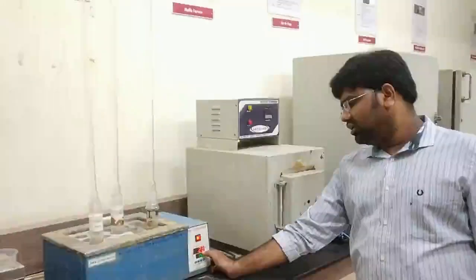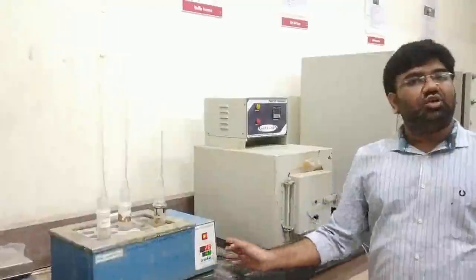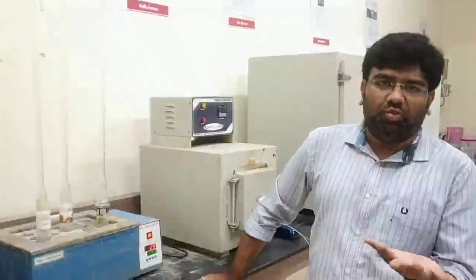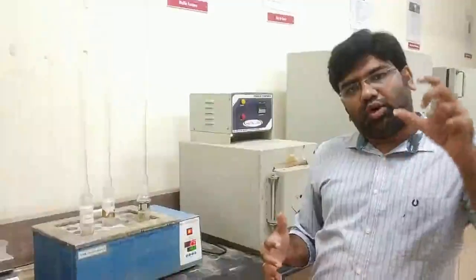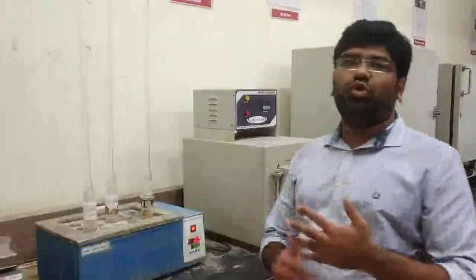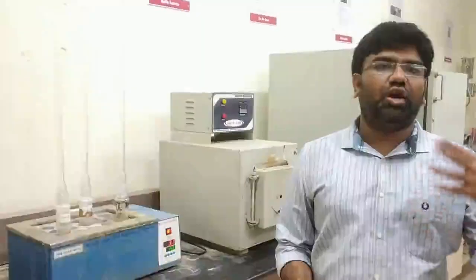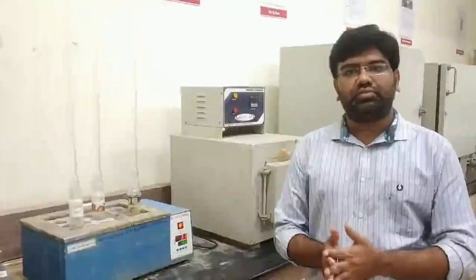After it goes from 28 degrees Celsius to 150 degrees Celsius, 1.5 hours of heating is to be done. So approximately you will require 2 hours of heating: 1.5 hours at 150 degrees Celsius and the initial 0.5 hour to reach 150 degrees Celsius. So we keep this for COD digestion for 1.5 hours, then some steps are to be done, and then we go for the titration process.